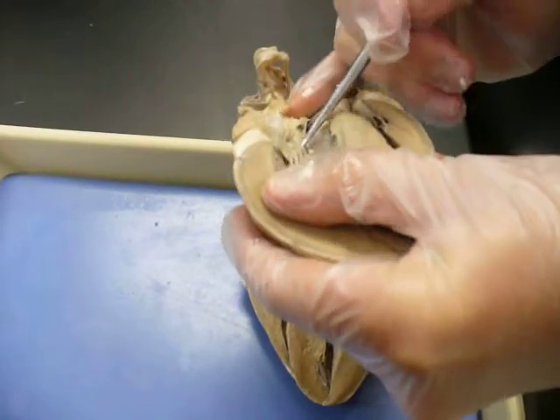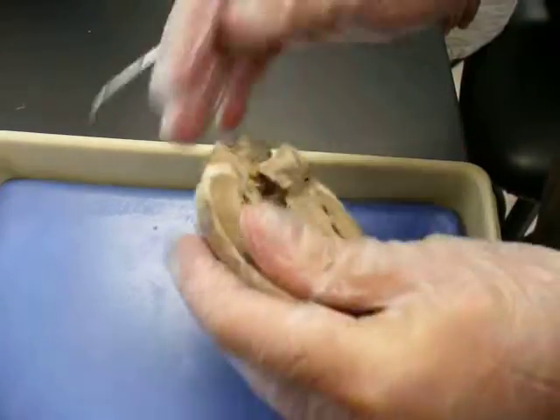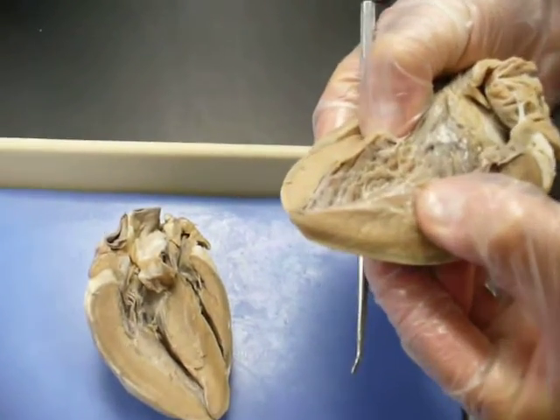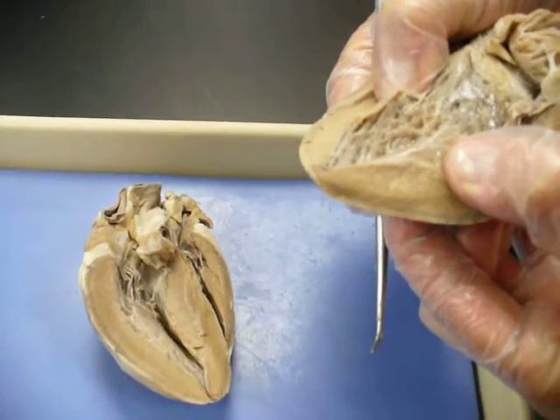That's part of the mitral valve right there too, along with the chordae and papillary muscle. You can really see the trabeculae carnea — it's bumpy, kind of like trabeculae in spongy bone.